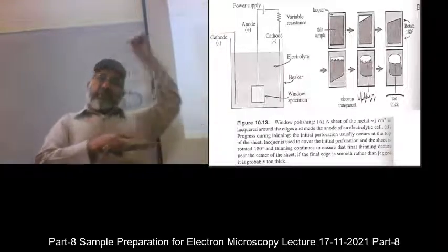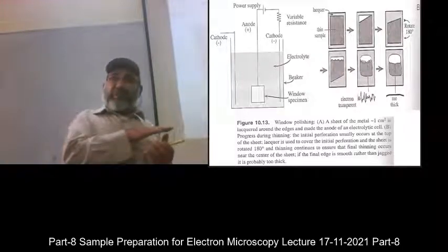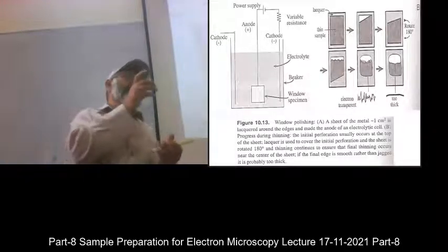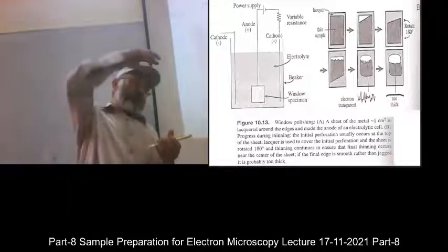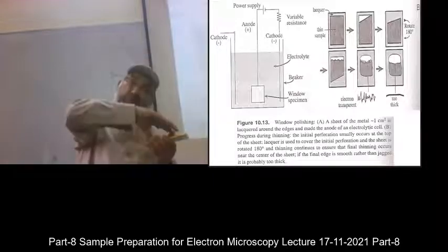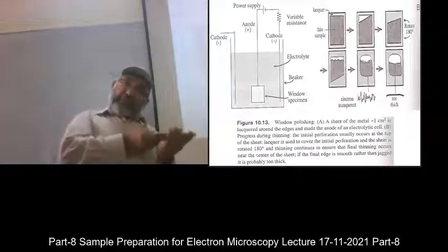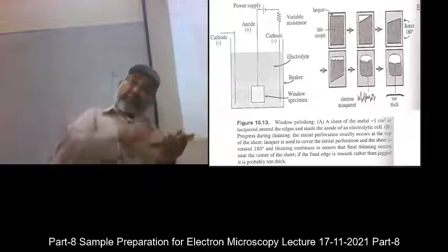For example, the sputter coater is sputtering gold particles onto the sample. It is used in vacuum, and gold particles or atoms are sputtered from the source onto the sample. Then you turn it around, then sputter it.